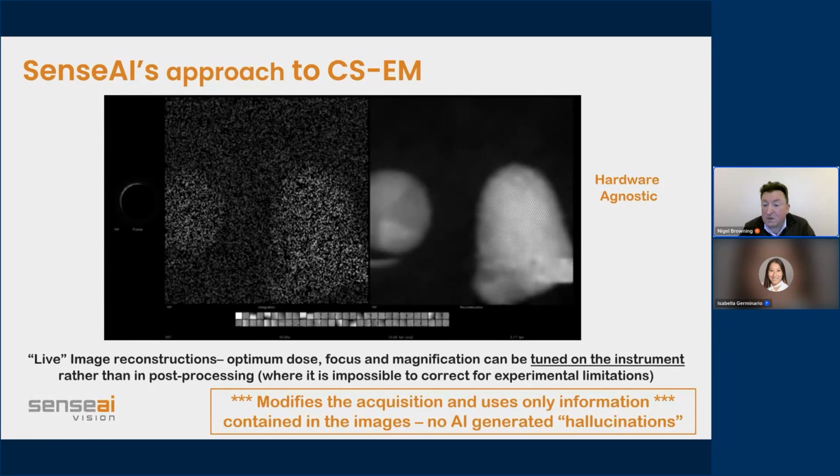So there are lots of ways that we can understand the image, and again, it is really important to conceptualize that once we've created our fully sampled image, you can do all the resolution checks you would do on a normal fully sampled image. You can take a Fourier transform, you can go through that process.